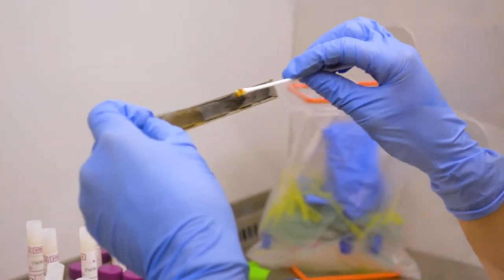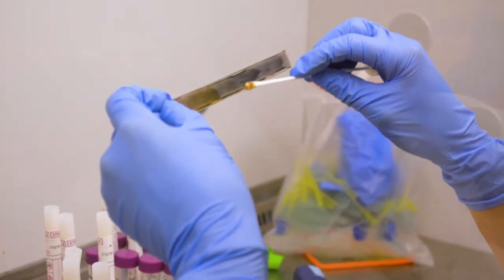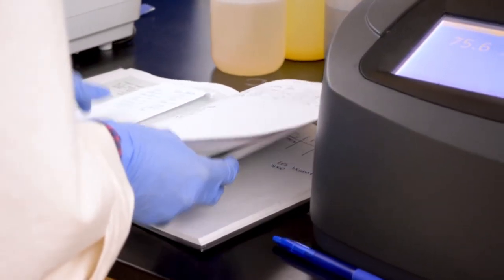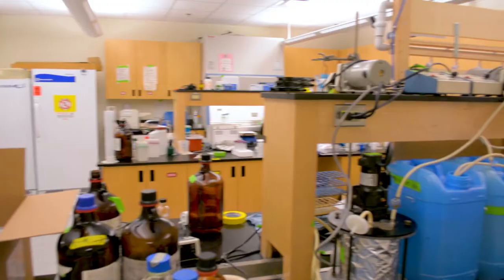Biofilm is just a thin layer of bacteria that forms, mostly in this case, on water surfaces. The main research question that we're trying to answer with this project is comparing two different graphene coatings. We're comparing the two of them, trying to determine which one better reduces biofilm growth.